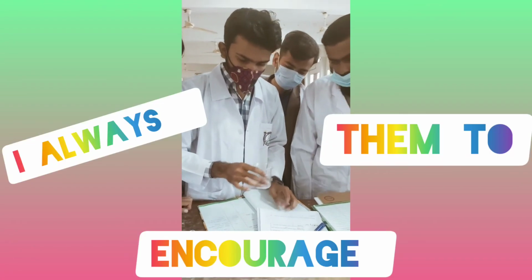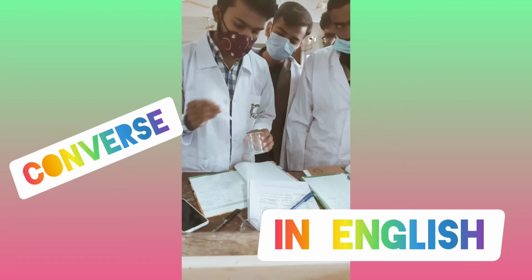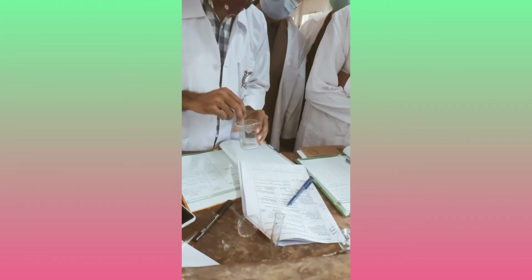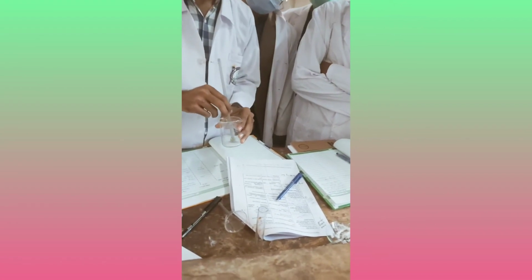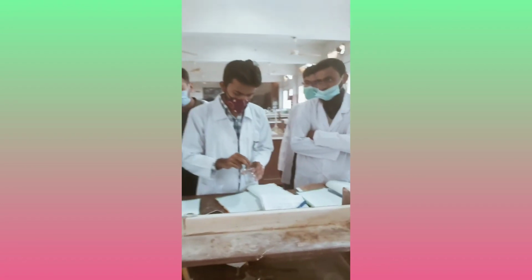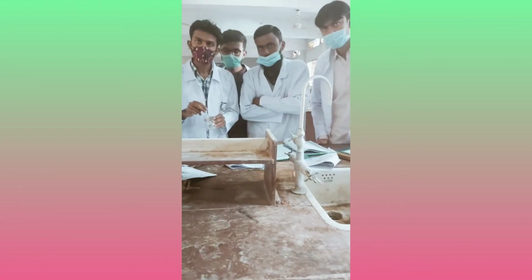Use a glass rod to dissolve, and if it's not dissolving at room temperature, add more solvent or heat it. Heat it from upside down. This is the right side. So dissolve it. Add some more solvent if it's not dissolving. Add more solvent. Take some more solvent and try to dissolve it. If it doesn't get dissolved, then just warm it over the flame, right?